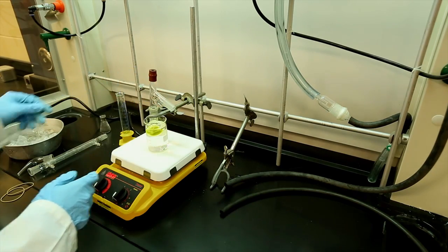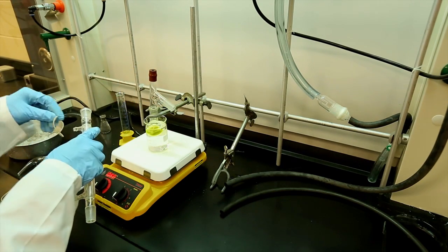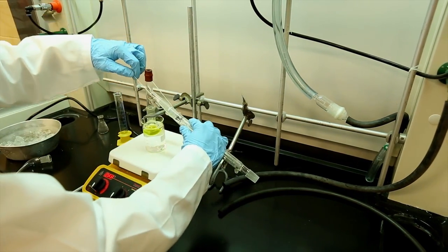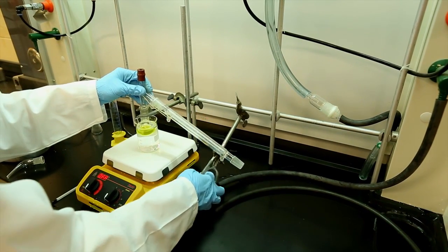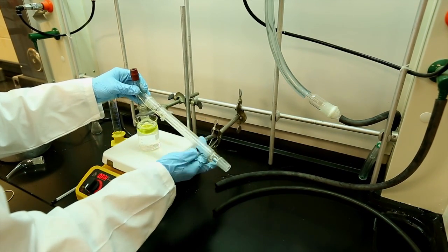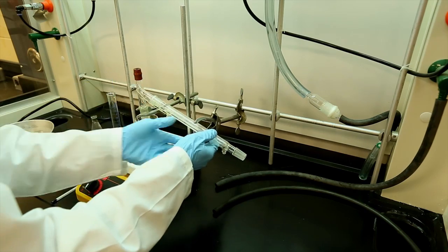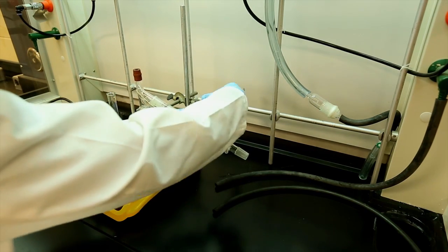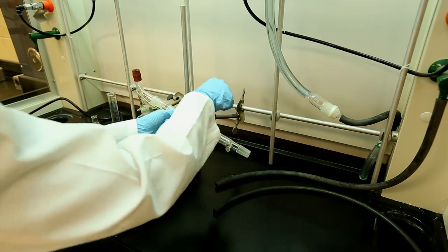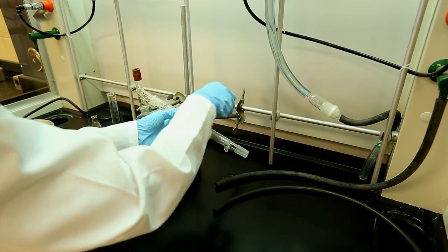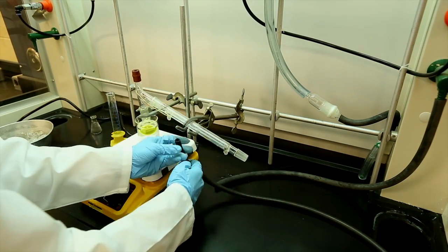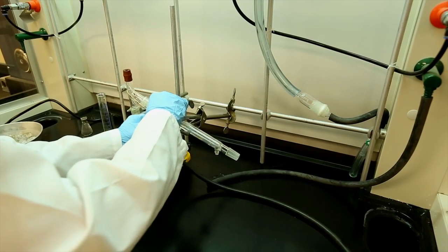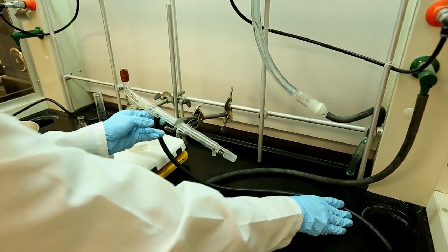In the condenser, there are two openings. The opening located higher up the condenser is the water output. A rubber tube attached here should drain into the sink. The opening located lower on the condenser is the water input. A rubber tube should connect this end with the water outlet located in the fume hood. A steady flow of water should be going into the condenser. A clamp will hold the condenser in place but make sure it's not tight since it may torque the setup and will cause vapors to escape.